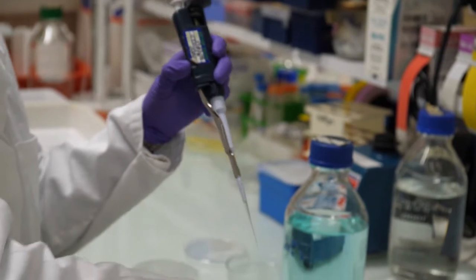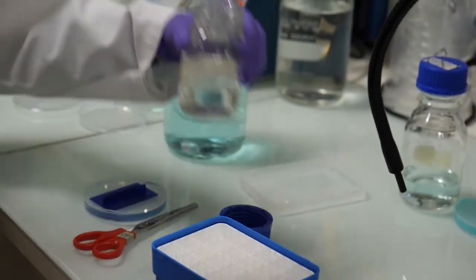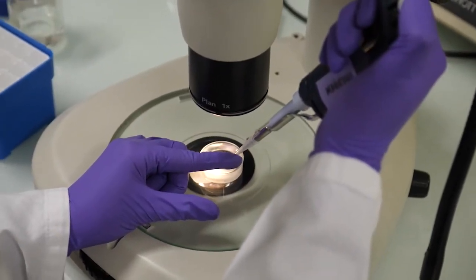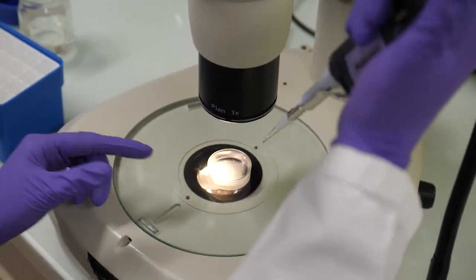About 20 to 40 microlitres of warmed 0.5 percent low melting point agarose is poured slowly on top of the embryo to prevent movement during imaging.